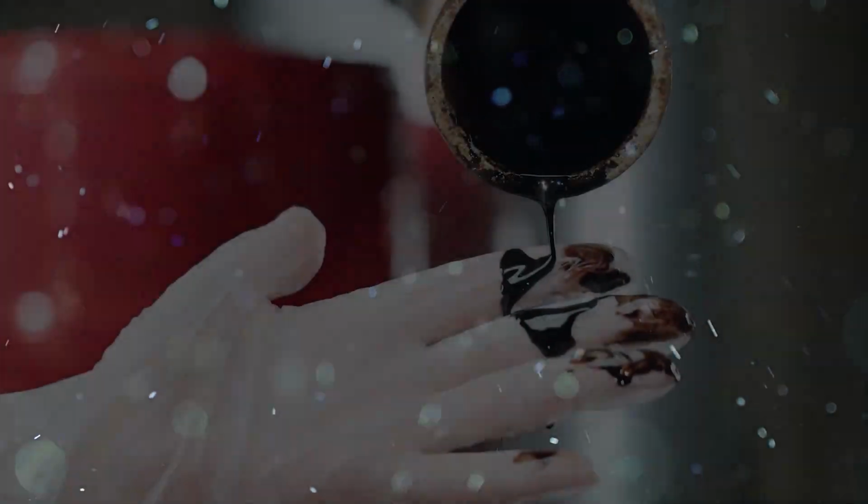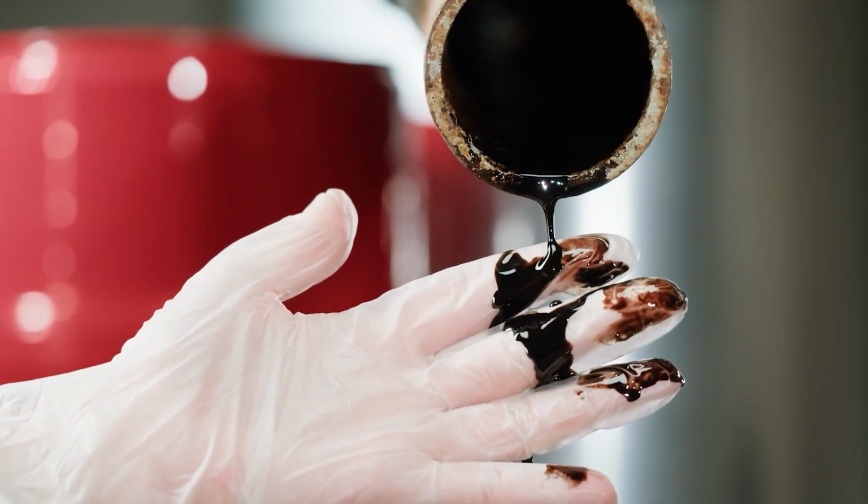So, characterisation of unknowns. This is quite a bespoke analysis that we created many years ago from our railway days. It's designed for looking at unknown materials, and these can be anything really. It can be a dust sample which is in an office. It can be a fuel jet which is blocked up with a sticky residue.